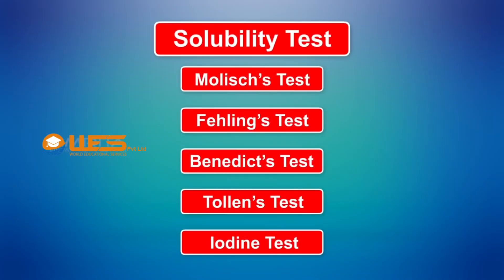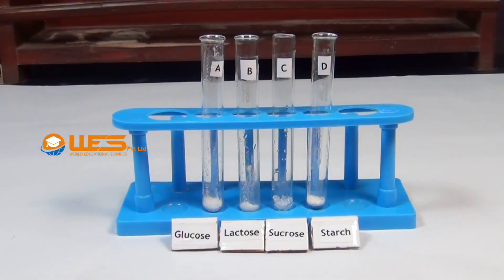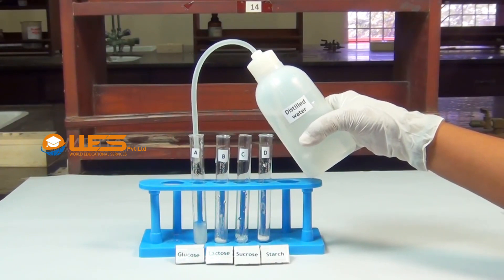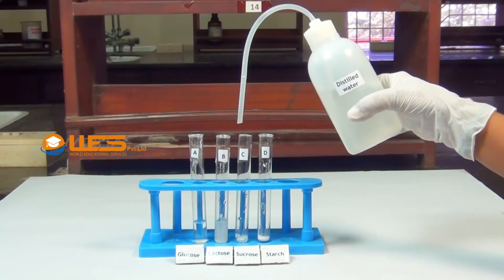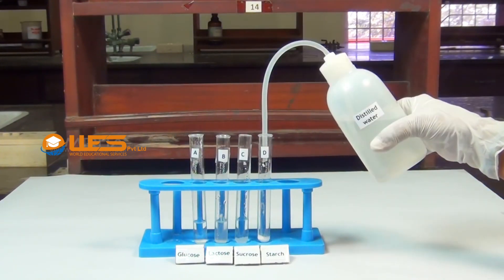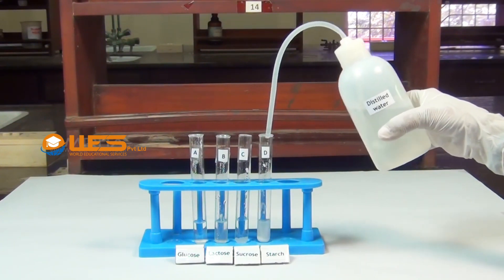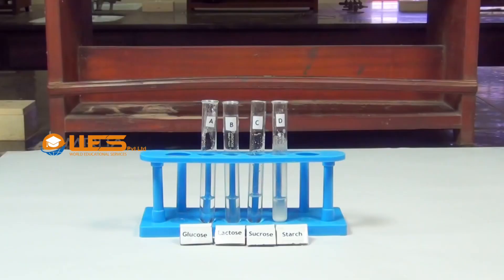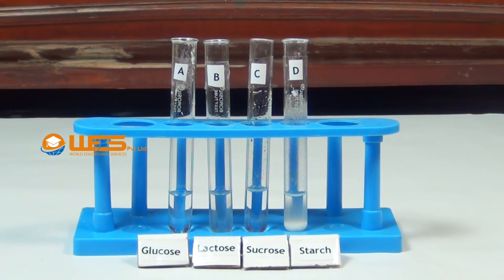Solubility Test. Take small amounts of glucose, lactose, sucrose and starch in four test tubes A, B, C and D respectively. Now add a small volume of distilled water to each test tube and shake well. We can see that glucose, lactose and sucrose are soluble in water whereas starch is insoluble in water.